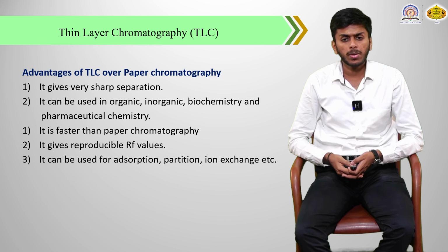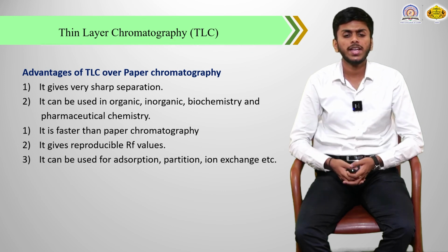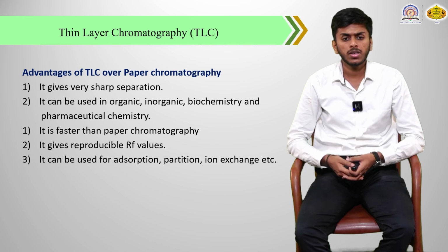Advantages of TLC over paper chromatography. It gives very sharp separation and is used in organic, inorganic and biochemistry. It is faster than paper chromatography. The RF value is reproducible and it can be used for adsorption, partition and ion exchange.